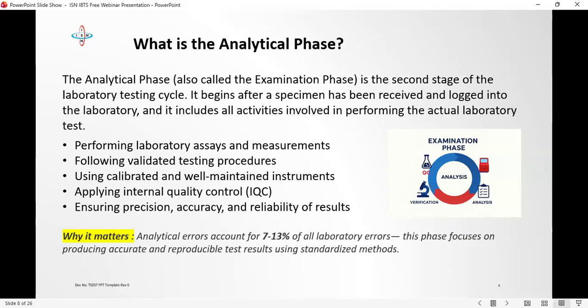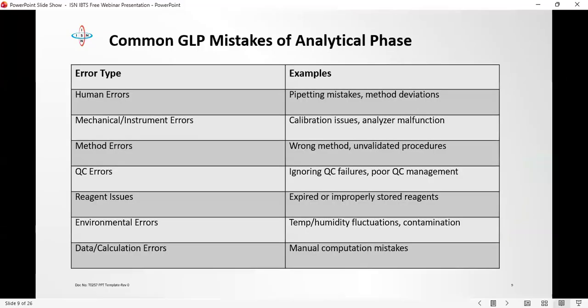So for some facilities, you see that their onboard stability has elapsed, but they are still making use of that reagent. Oh, we're trying to cut costs. We don't want to waste our reagents. But that is going to pose a great risk for your facility, because good laboratory practice is not just about checking expiry dates, it's about understanding reagent behavior. So you want to make sure that your reagents are behaving appropriately, the way they are supposed to behave.